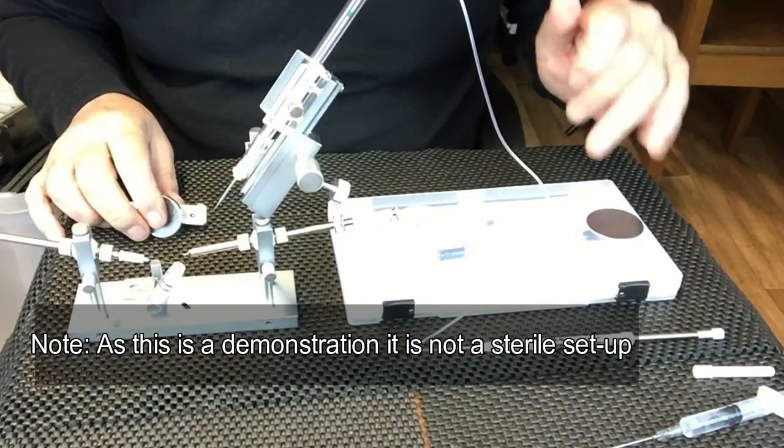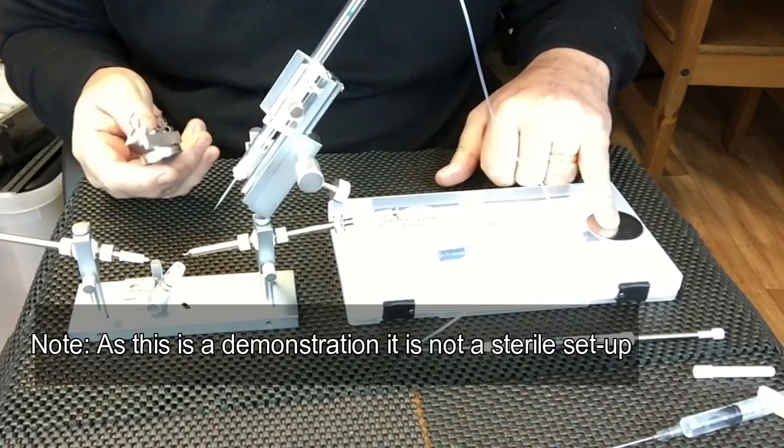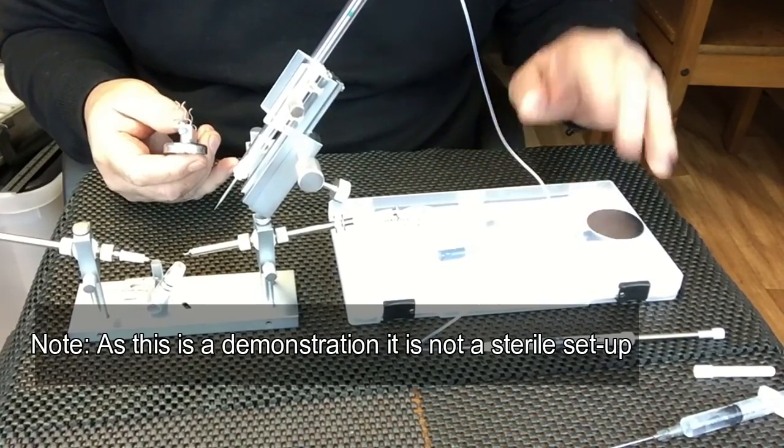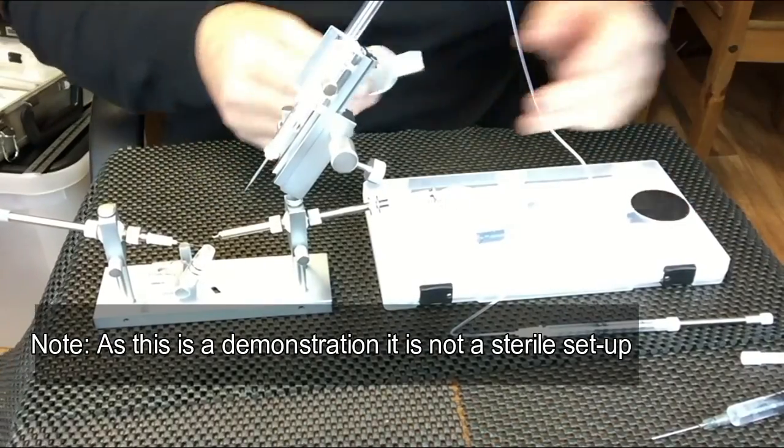You can, if you wish, fix the metal disc that came with your magnetic holder onto the actual box, or you can fix it to a piece of perspex or wood.